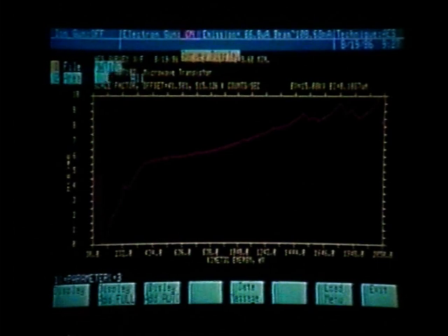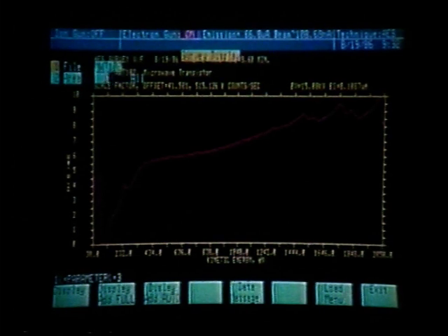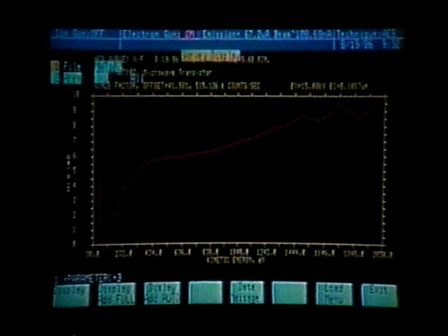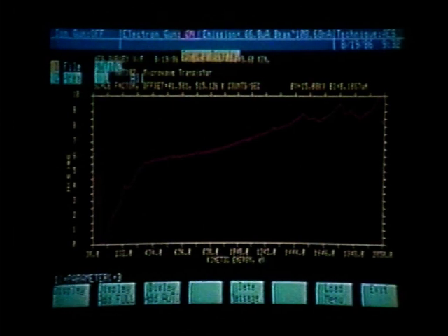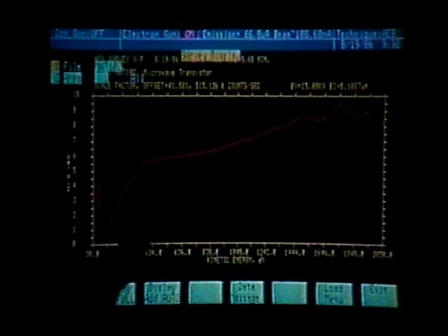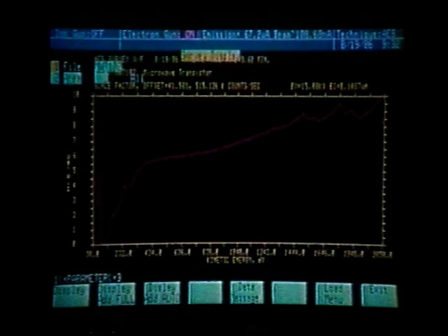Soft key number 2 would allow us to display add full — we could display add another area on top of this area at full scale. Soft key number 3 would allow us to display add another survey scan to this survey scan, where it would automatically be scaled in relation to this one. Soft key number 5 would allow us to enter the data massage banks. Soft key number 7 would allow us to return to the load menu to load any other files stored on the data disk. What we want to do is differentiate and smooth this survey scan to identify the major elements present on area number 1, so we press soft key number 5.